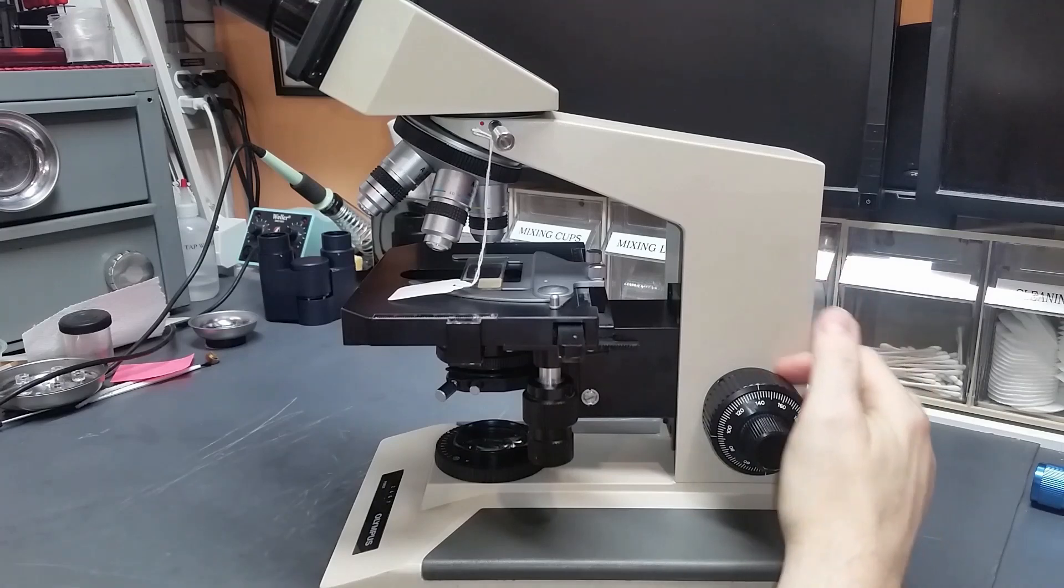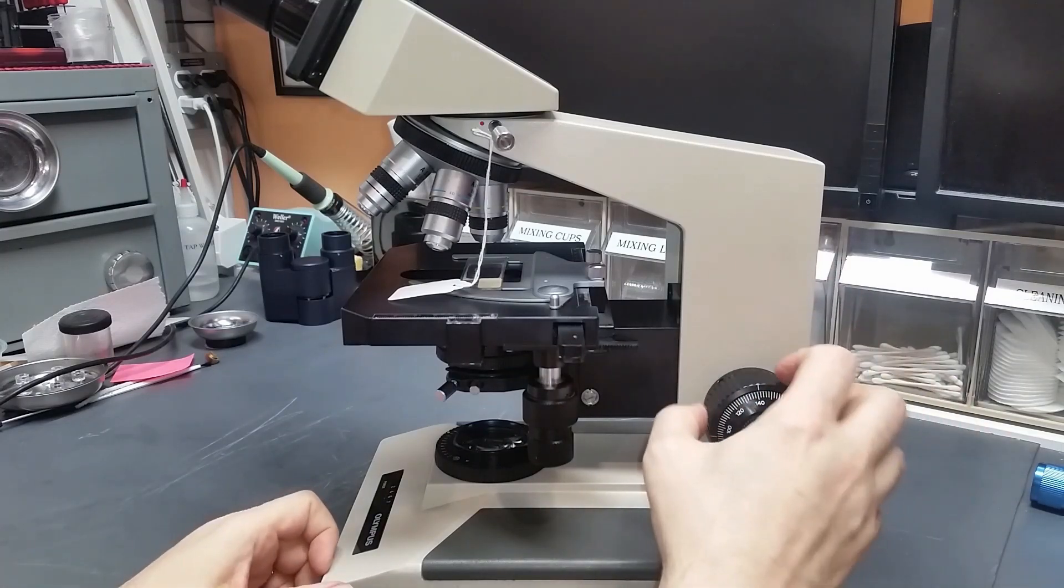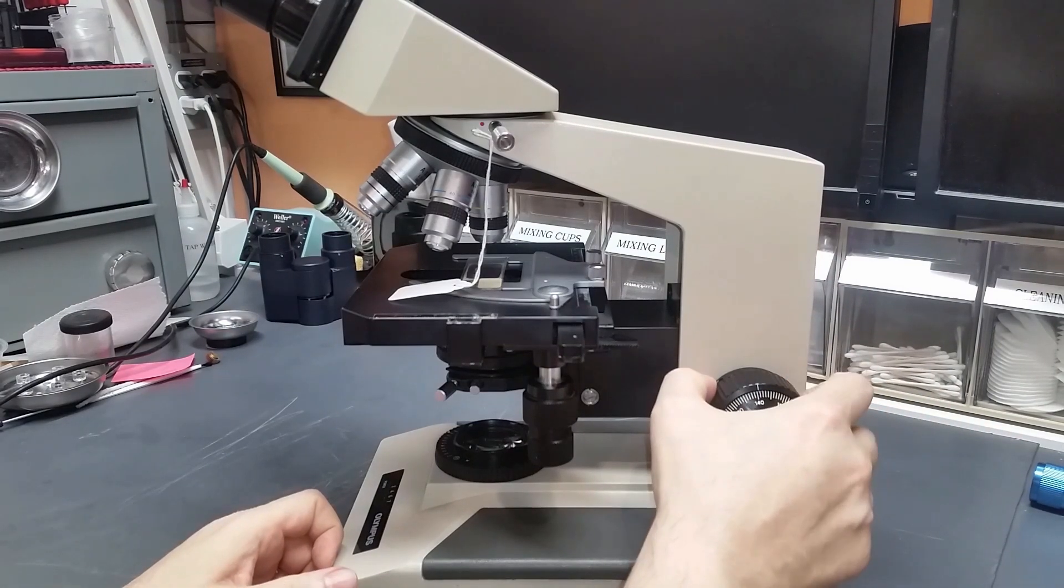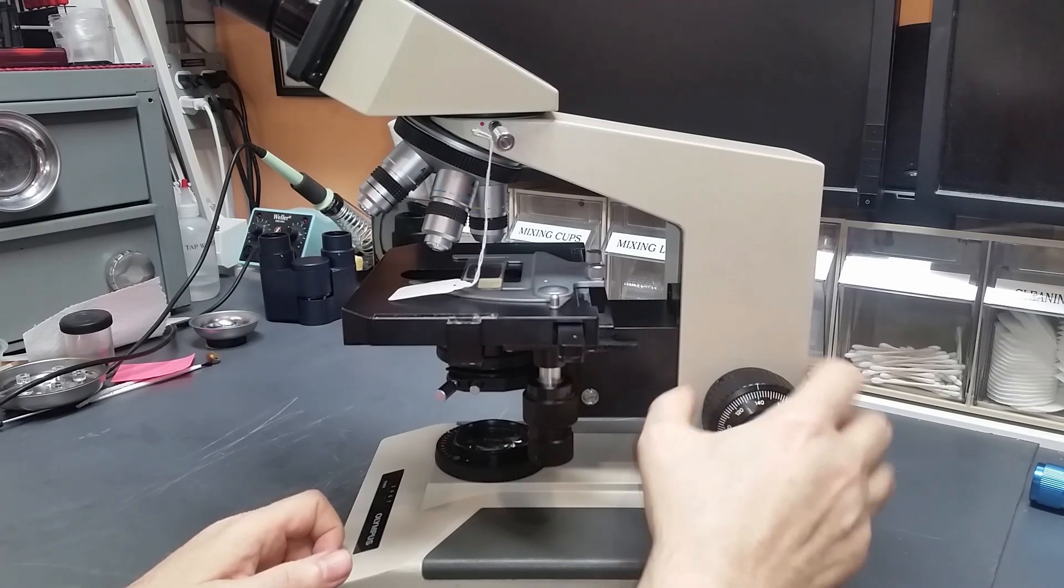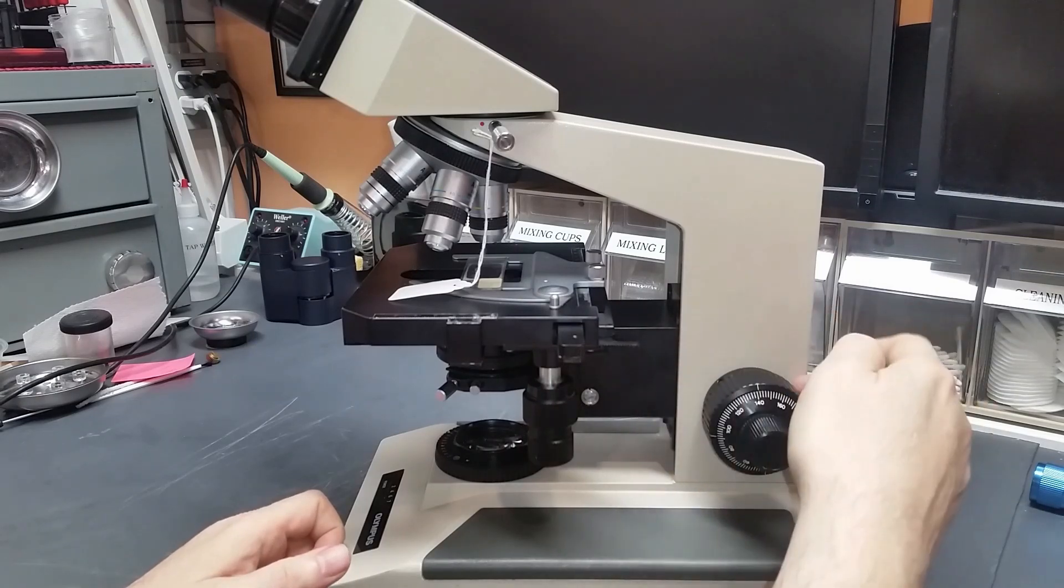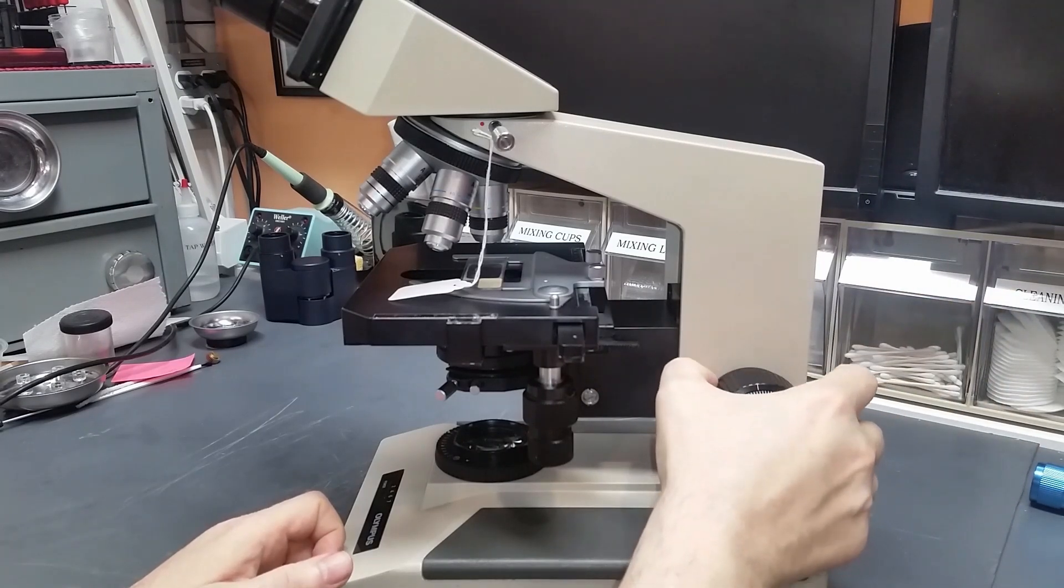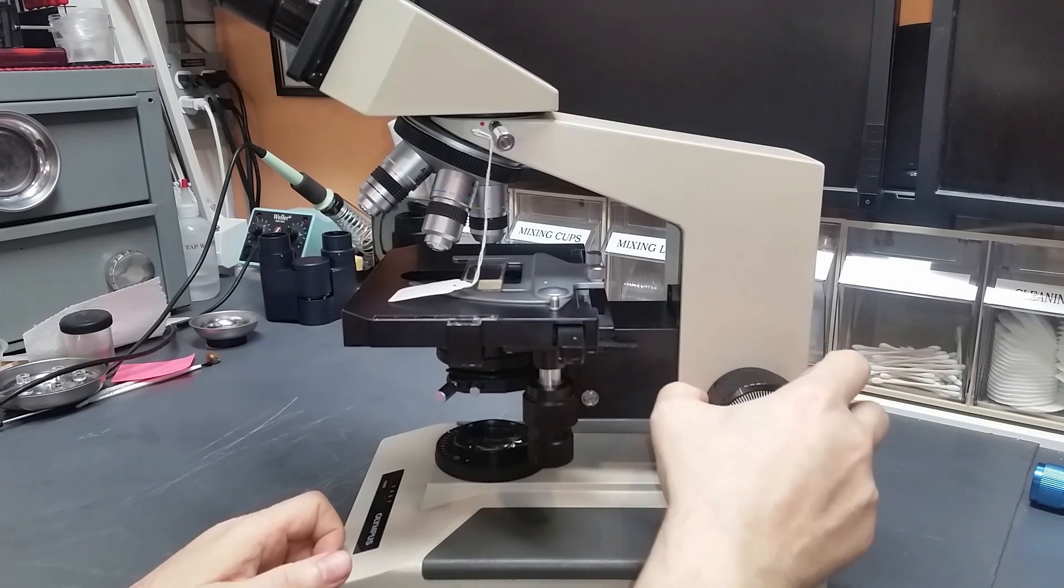There is a tension adjustment collar just behind this coarse knob. Usually you can adjust it by hand. If not, there are a couple of holes where you can stick a pin in and adjust it. But if I loosen this up by turning it counterclockwise, you see that guy is taking off spinning because gravity is just overwhelming the inherent tension in the mechanism.